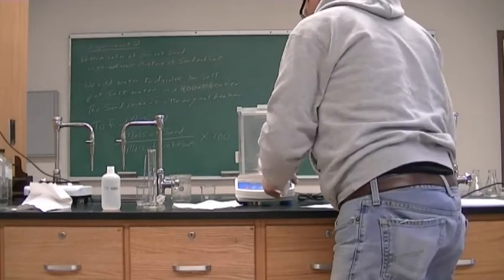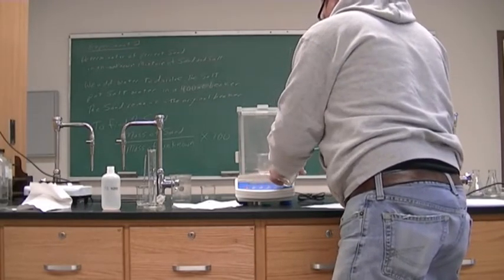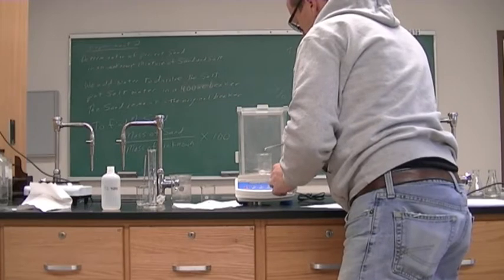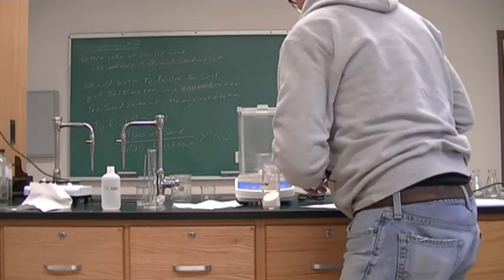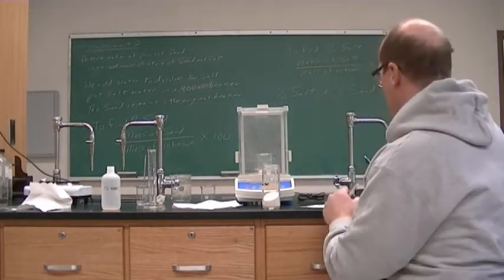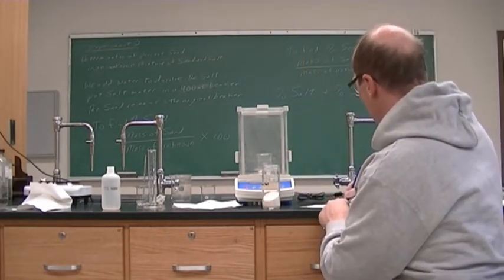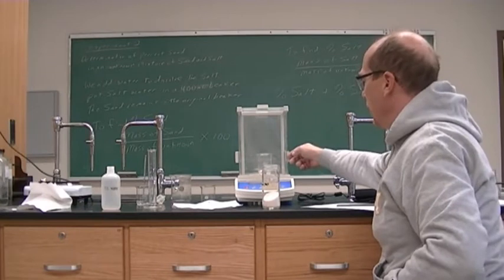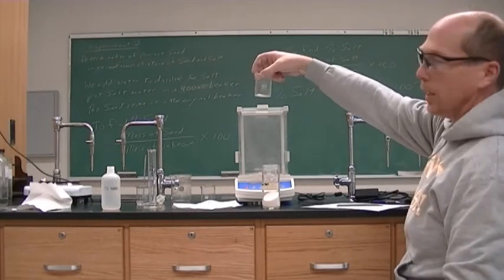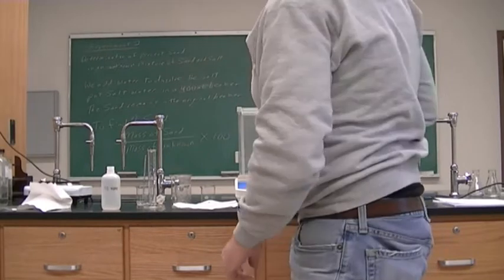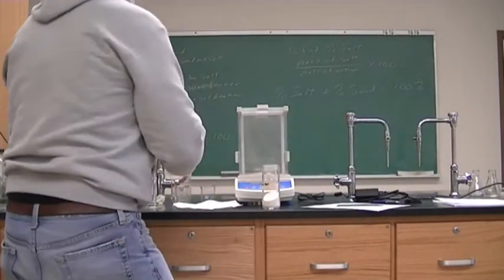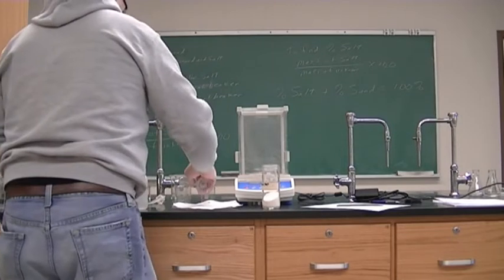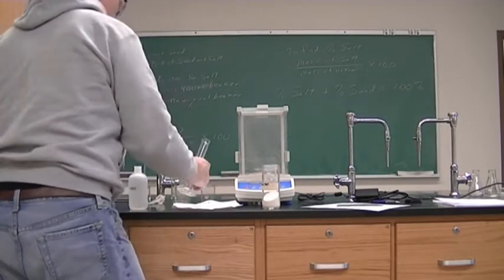We're going to add the unknown again — it's about 48.3. We are at 48.4206. We don't have to worry about getting that mixed up because I have that beaker labeled as number 2. So we will add 15 ml of deionized water to that and let the salt begin to dissolve.